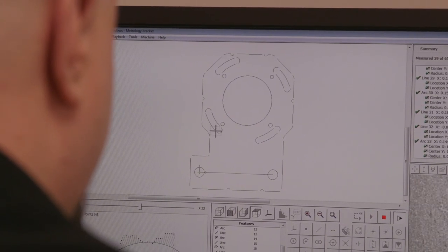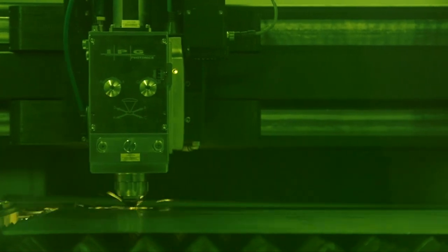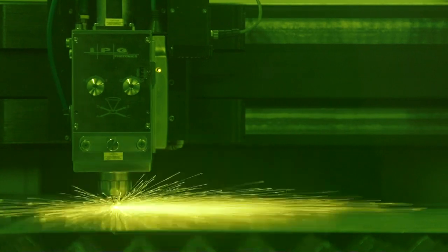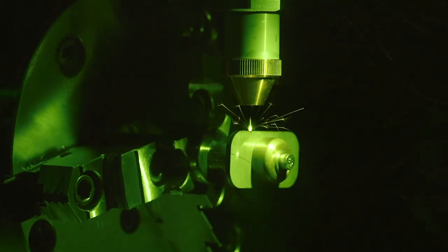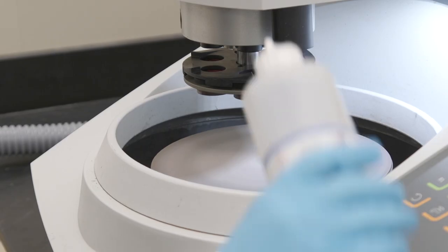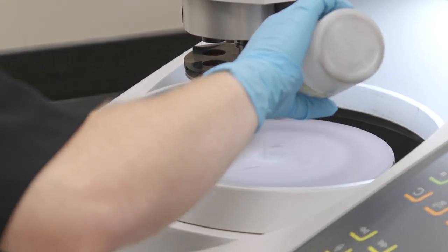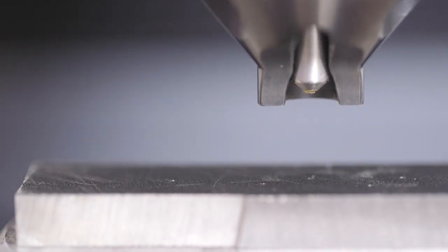Here at IPG we have a metrology lab and a full-on metallurgy lab. Because at IPG it's all about laser processing for us, we really use these to fully characterize the parts that we machine. We can prepare the samples for adequate metrology and all the measurements that we need to do, and then fully characterize them in terms of properties from microstructure to mechanical properties as well as chemical composition.